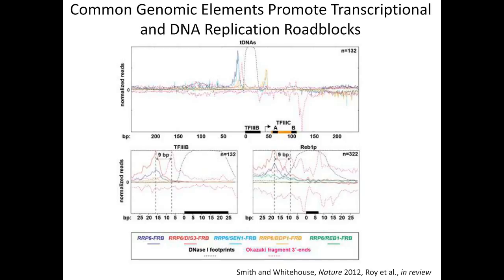Okay, great. And their second part of the question, do you think techniques you use to reduce the number of reads with multiple hits can be applied to DNA sequencing?